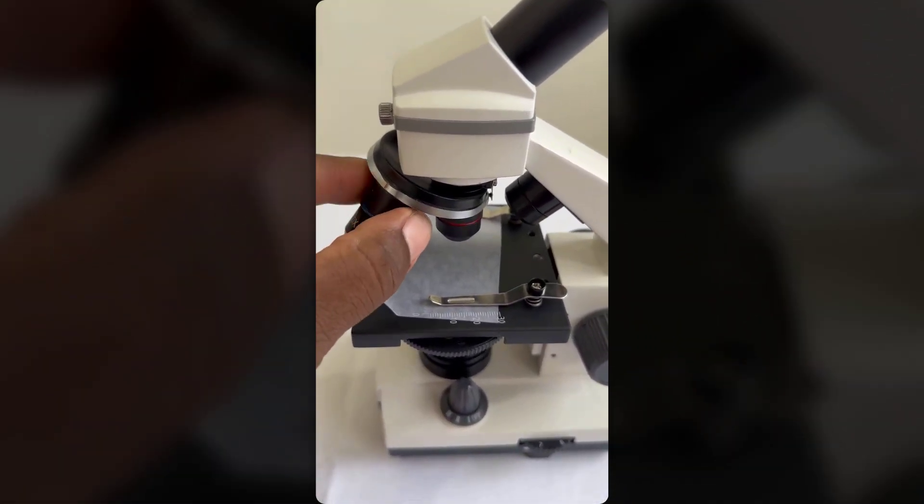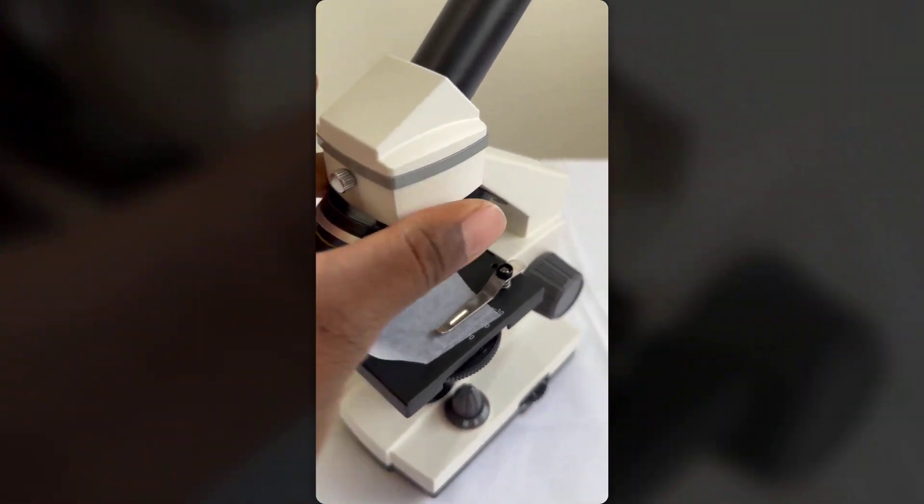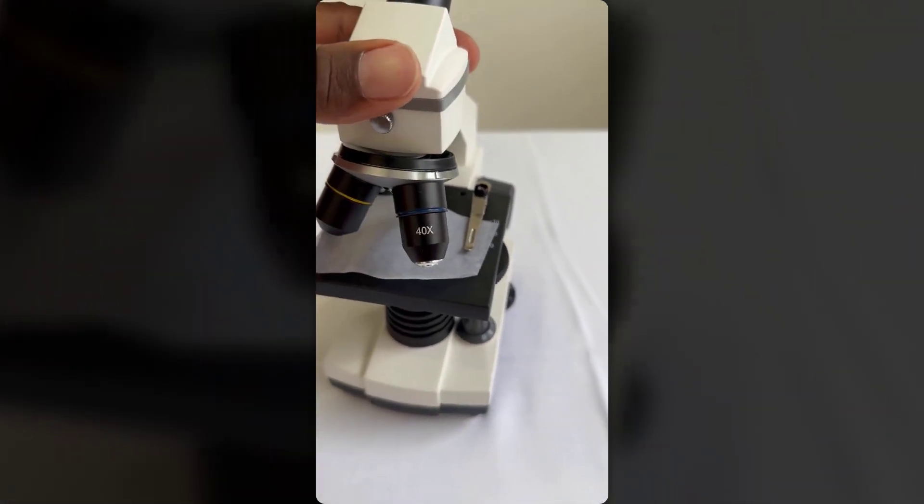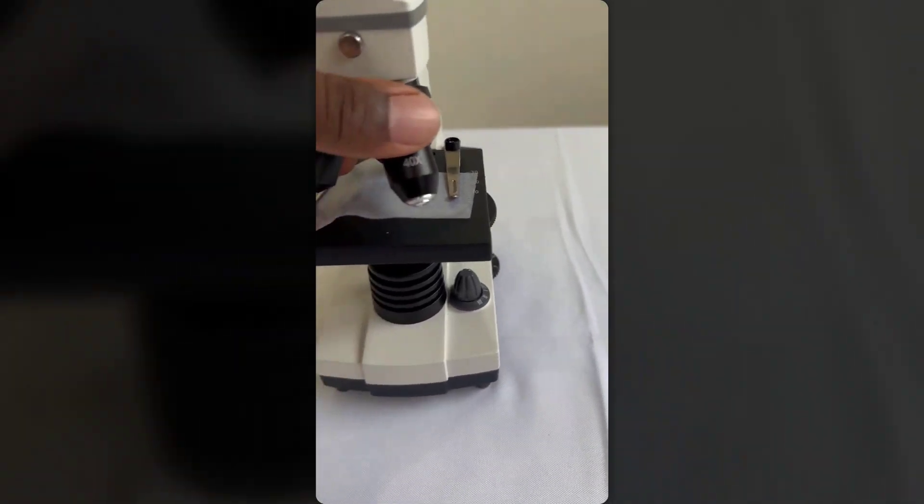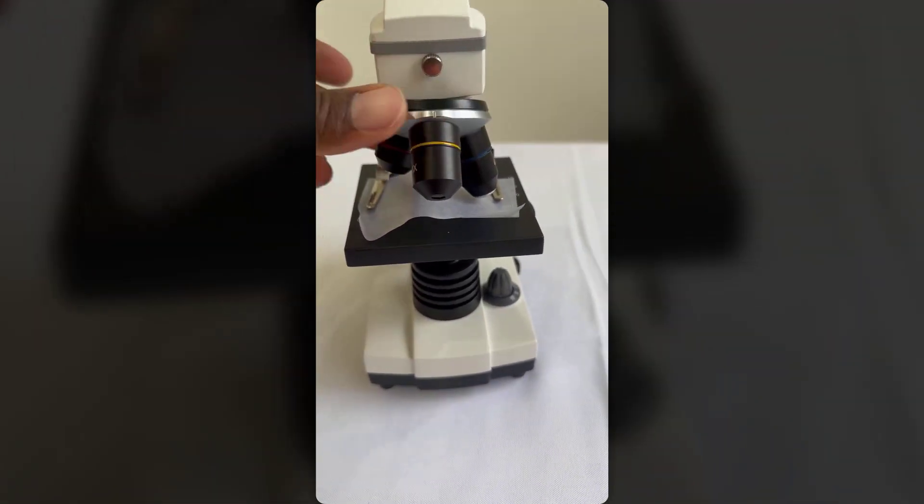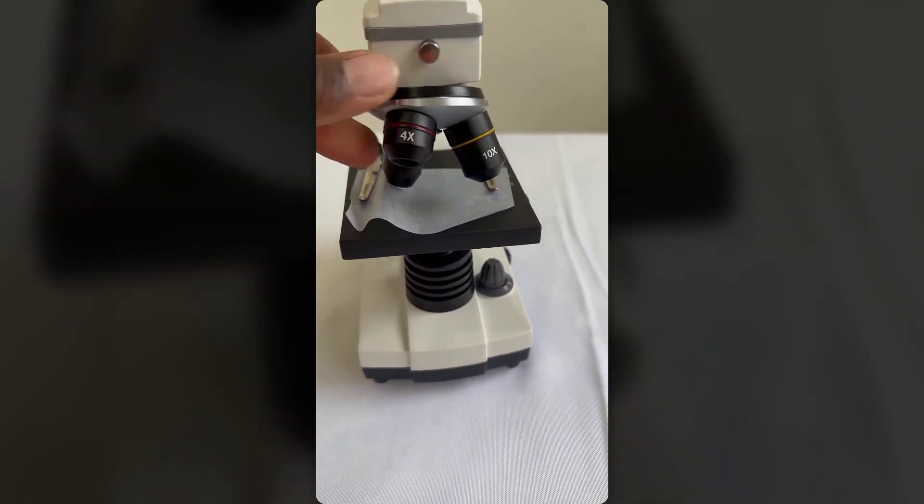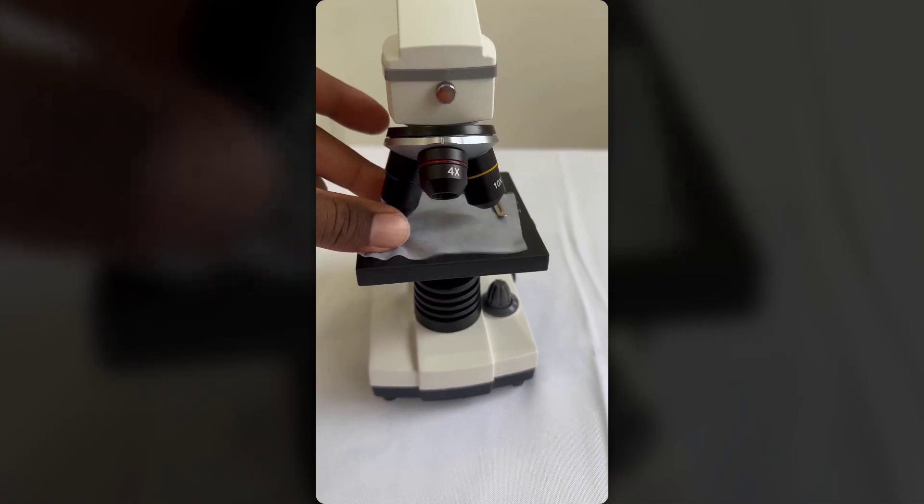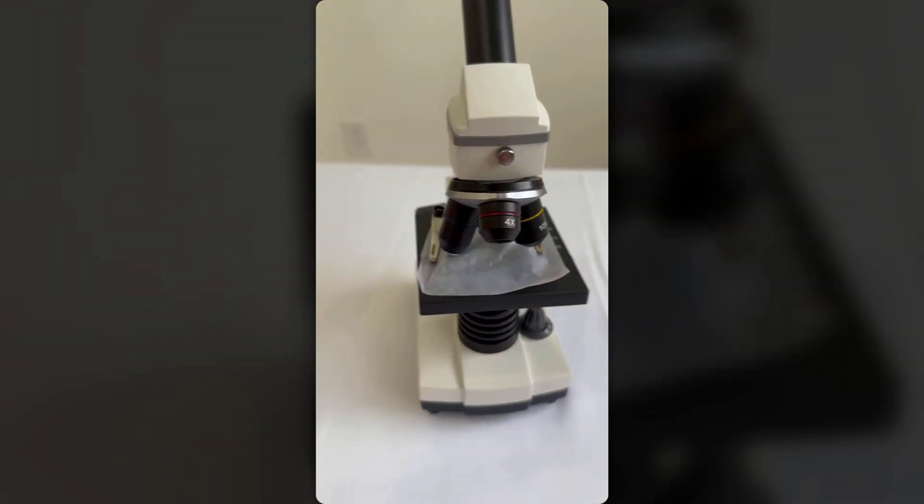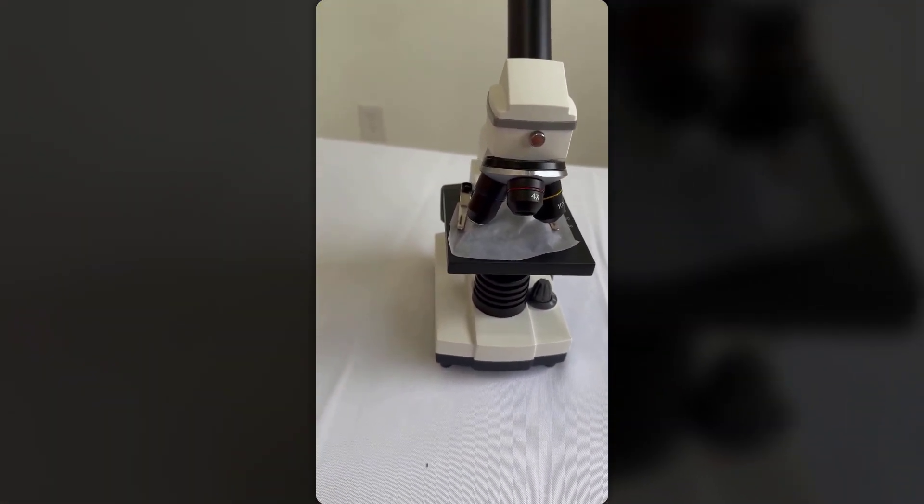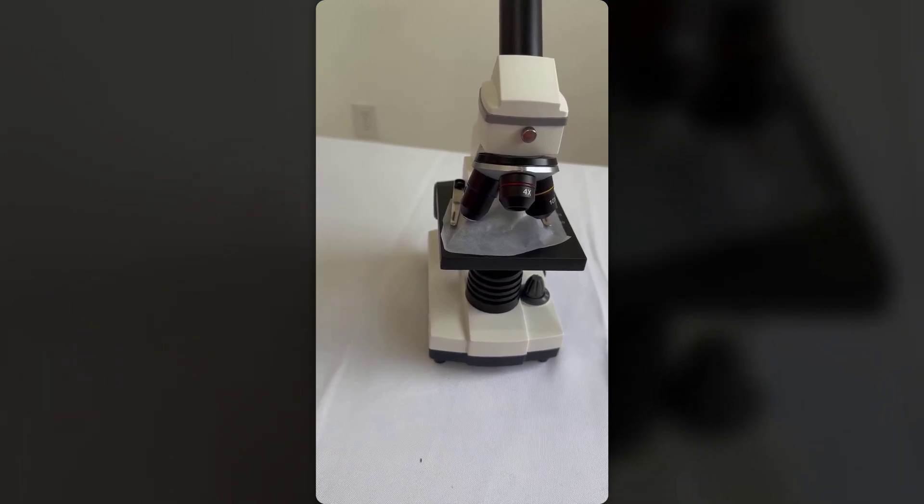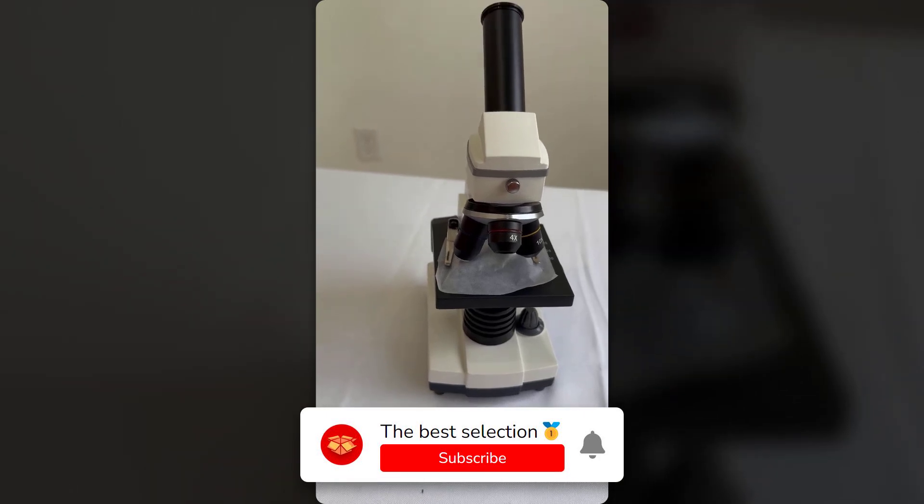The integrated dual LED illumination system delivers crystal clear visibility with adjustable brightness levels for different specimen types. While the phone adapter installation requires some initial patience and mastering the illumination controls takes practice, these minor challenges are quickly overcome. The inclusion of a Bluetooth remote shutter significantly simplifies image capture compared to similar models, making documentation effortless once set up.